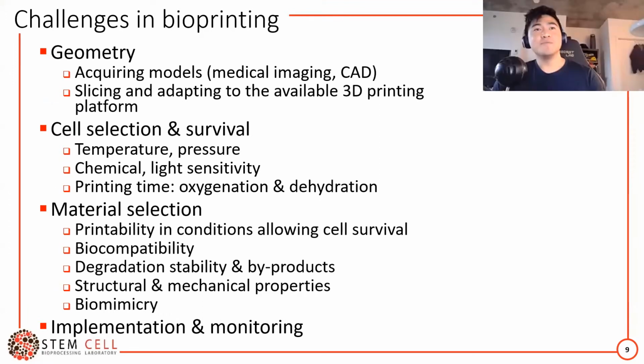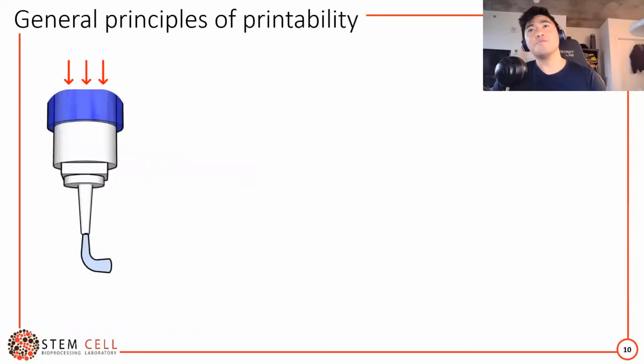Great. So now that you have a good idea of the background around 3D printing, I would like to talk to you about how you can create your own 3D printing material, or how can you implement 3D printing for your own research. So here, let's talk about the general principles of printability, or materials that you can 3D print.